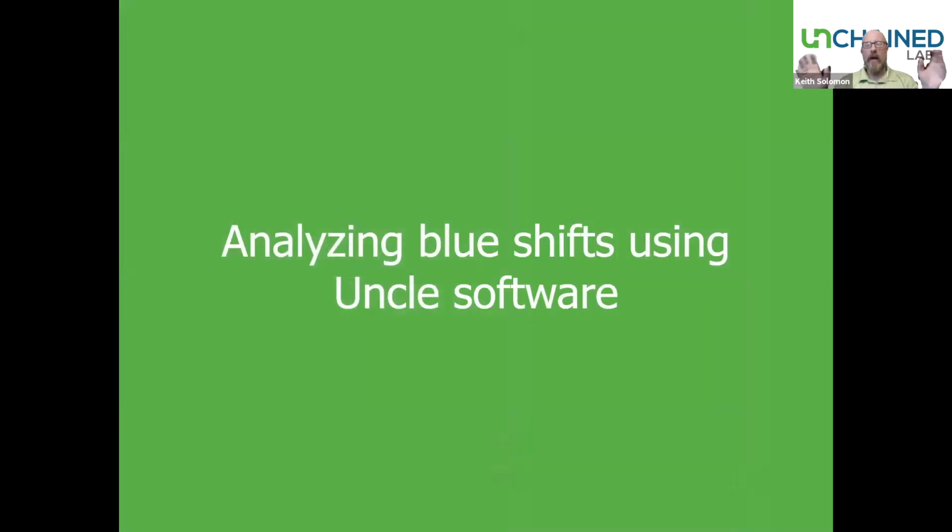Okay, so now that we've looked at blue shifts and we understand what they are from a biophysical and biochemical basis, let's talk a little bit about the Uncle and how Uncle allows you to analyze blue shifts. Some of you may have an Uncle and can go right back to your instrument and start analyzing blue shifts. Some of you don't have an Uncle, and this will be a small primer in how user-friendly the Uncle software is with regards to looking at blue shifts.